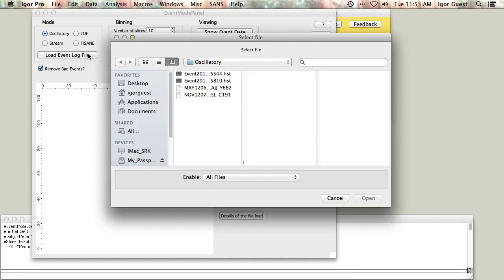And this is typically a data file that starts with an event. It's tagged with a date and time string starting with the year. Unfortunately, this number has absolutely nothing to do with the file name. It is closely related to the actual collection time of the VAX file, although the clock on the histogramming memory and the clock on the VAX are not in sync.